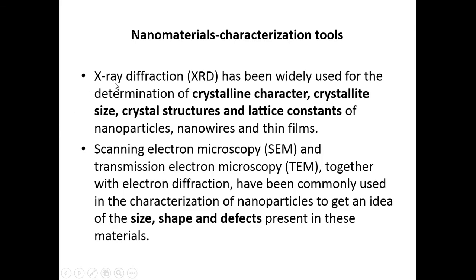First one, X-ray diffraction, XRD. X-ray diffraction has been widely used for knowing the crystalline character, crystallite size, crystal structures and lattice constant of nanoparticles, nanowires and thin films. It is a characterization tool used for knowing the crystalline character of the surface of the material, the crystallite size of the film formed, or the crystal structures and lattice constant of the nanoparticles, nanofilms or nanowires.